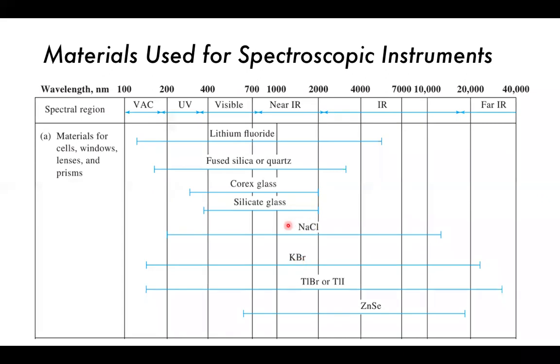humid conditions. And these are single crystals of sodium chloride. So they are kind of transparent even to our eyes. But if they start to frost up because of maybe some of the moisture dissolving some of the surface sodium chloride, then they're not going to be useful anymore. They're not as expensive as something like fused silica or quartz, but they have a limited range of uses.